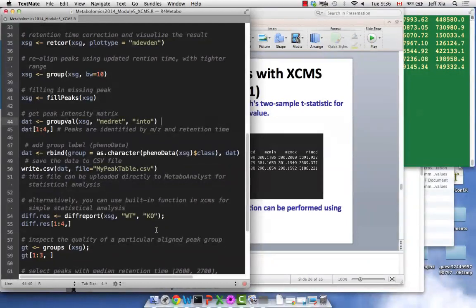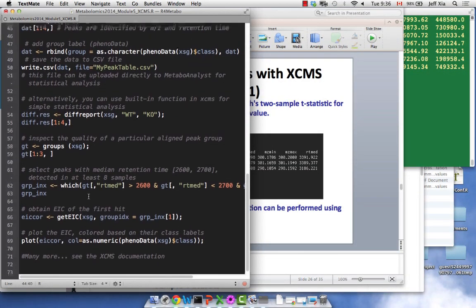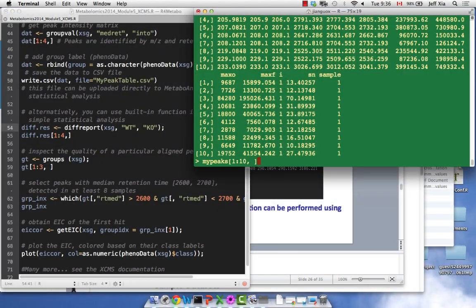It is in the script, in the lower part. The last part we did, peaks. Oh yeah, sorry, peaks is just for visualization. It's not useful. Not a script, no. Okay, you can write it down.